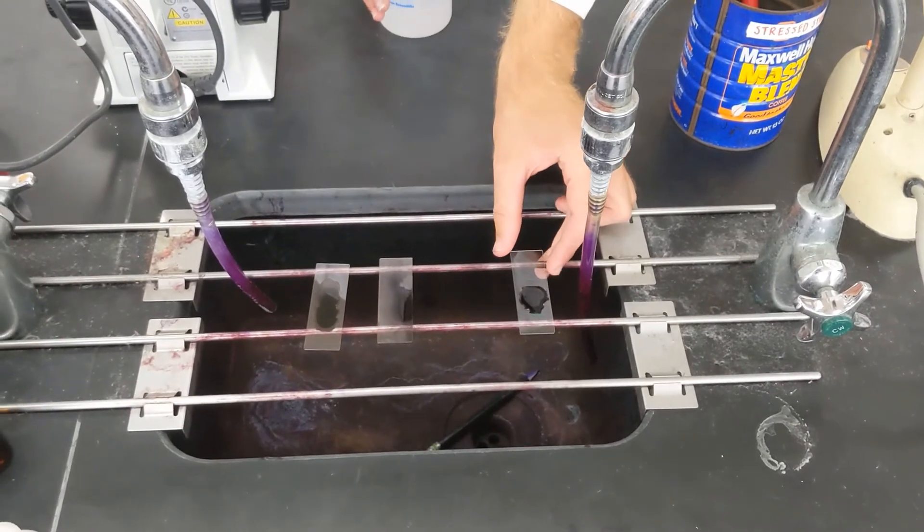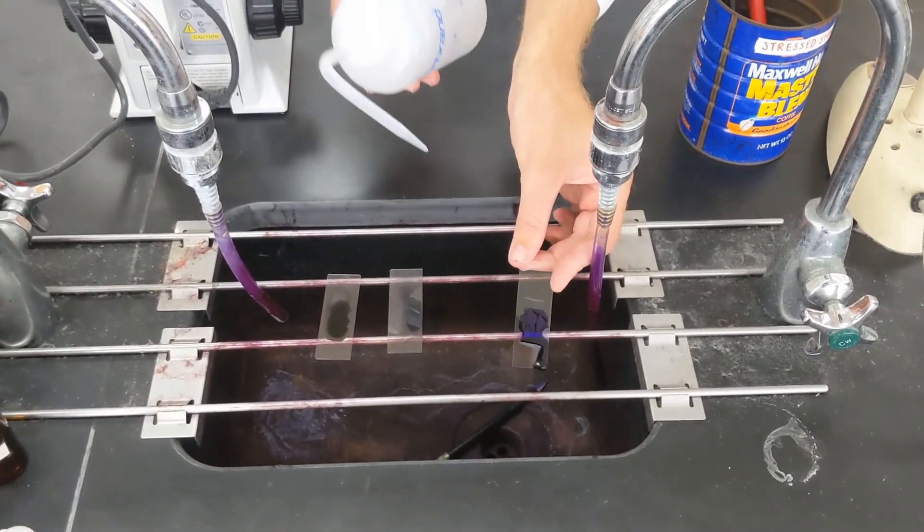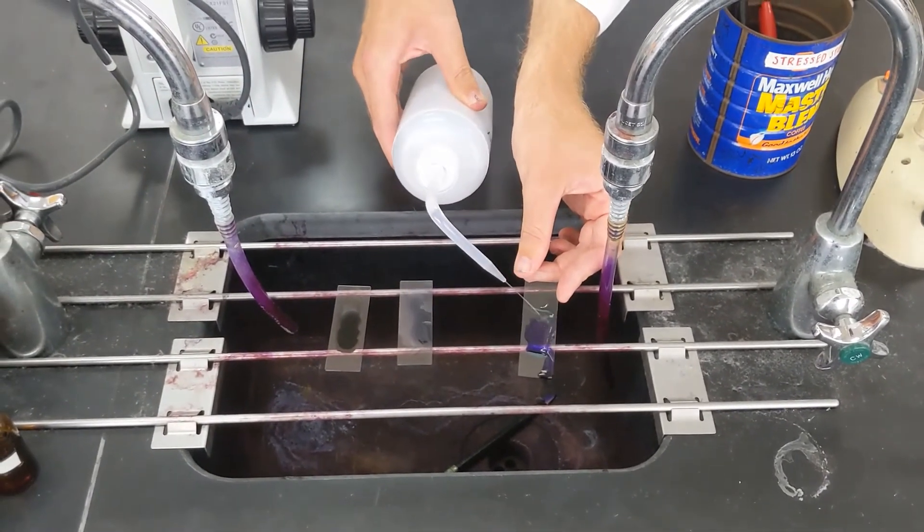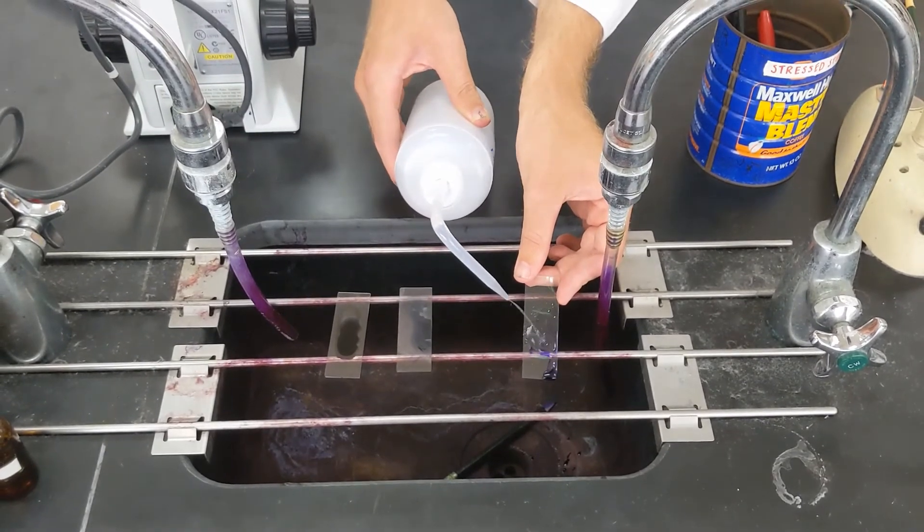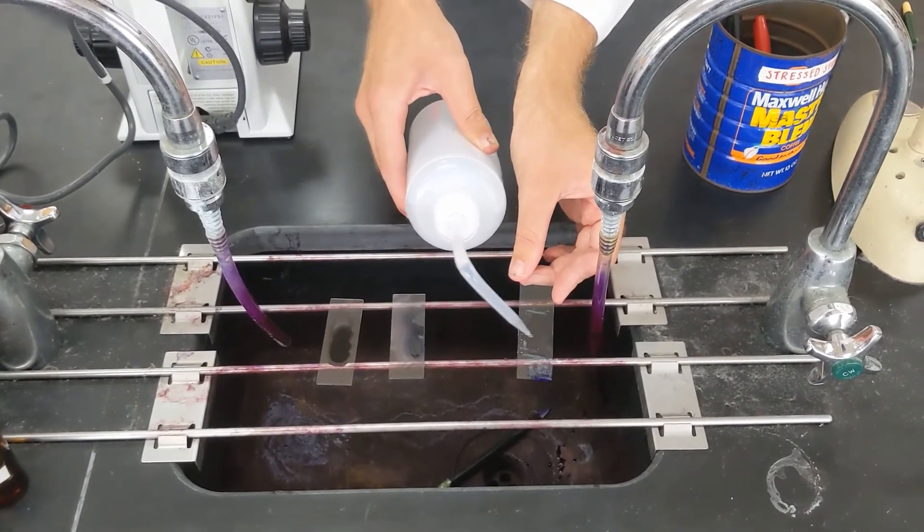So then after you let your stain sit for 30 seconds to a minute, take it and just wash the slide gently off with water. Not trying to blast it off or anything, just do it gently.